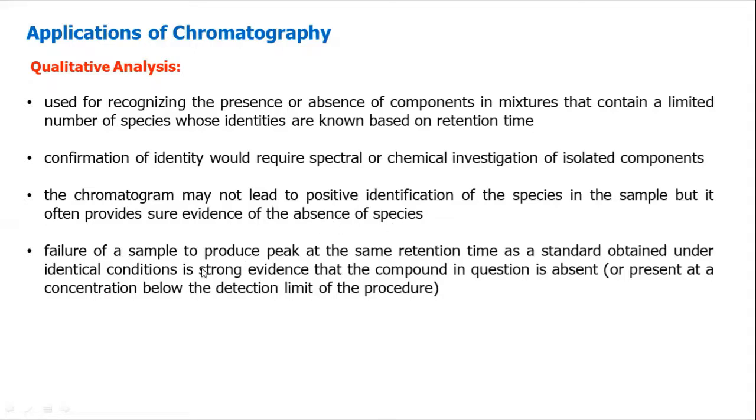So failure of a sample to produce a peak at the same retention time as a standard obtained under identical conditions is strong evidence that the compound in question is absent or present at a concentration below the detection limit of the procedure. For example, magrun og standard, then magrun og sample. So, same silang condition giran.